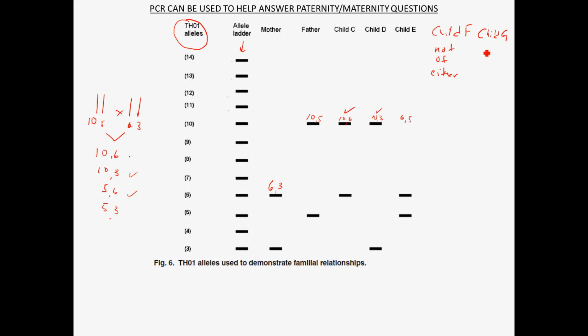So typically we have paternity questions. So show me what the results would be, where the mother is known, but it would not be that father. Be able to show me what those would look like.